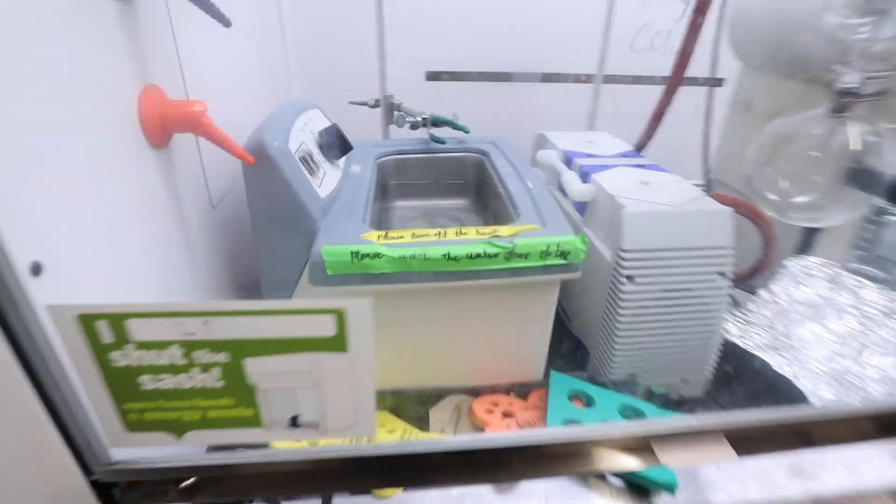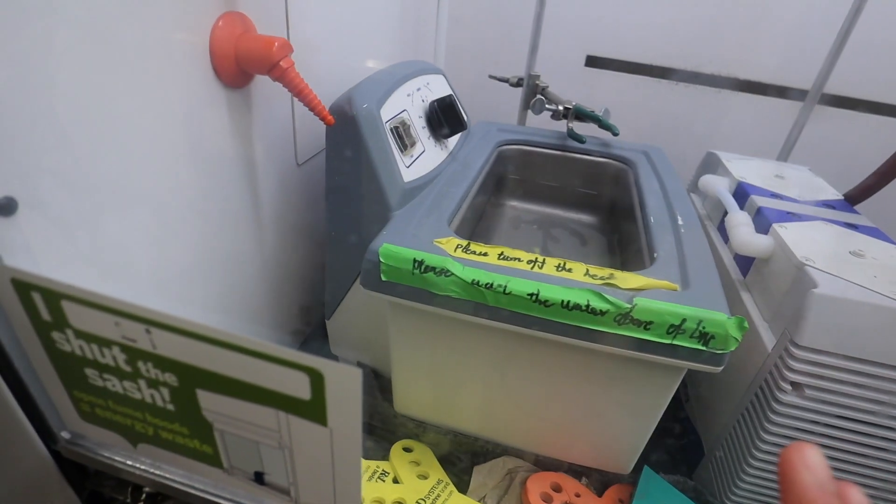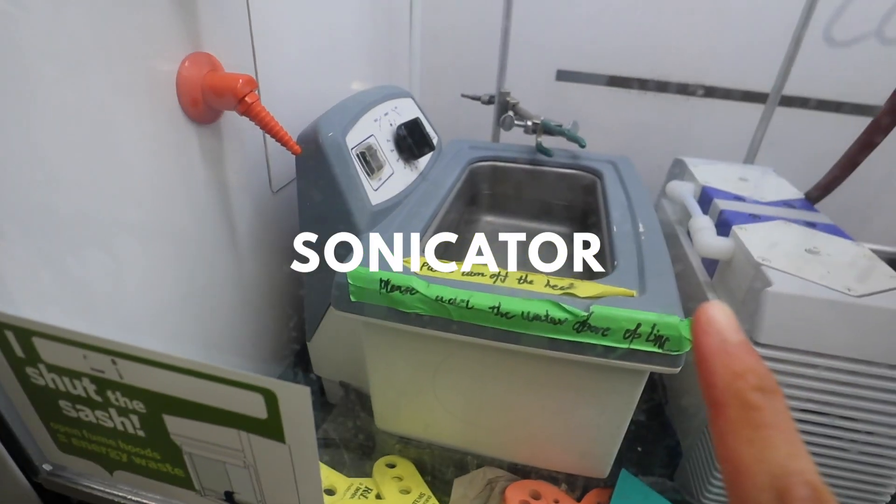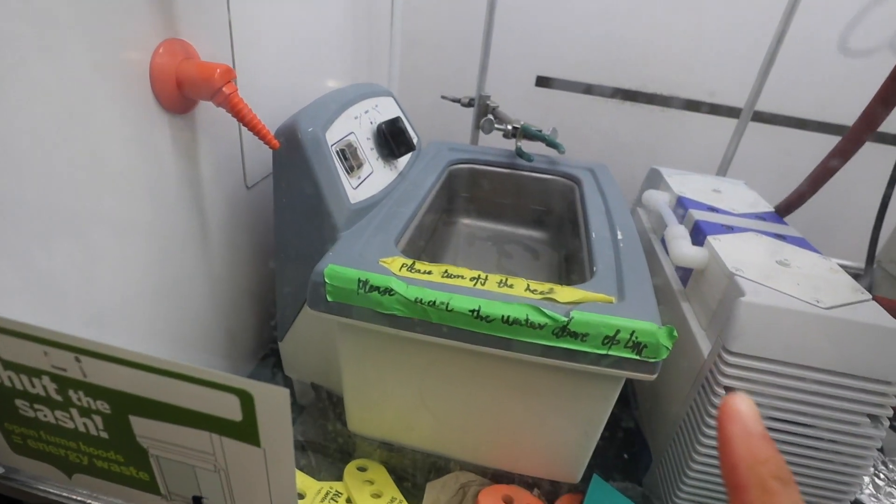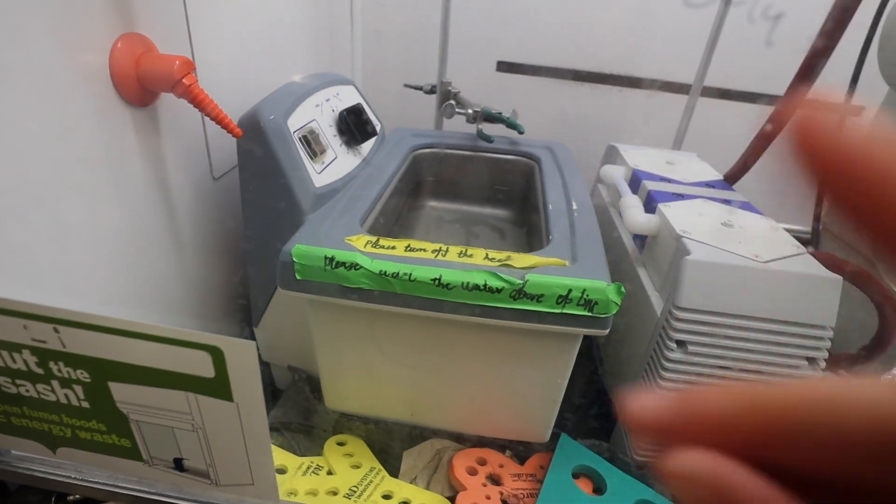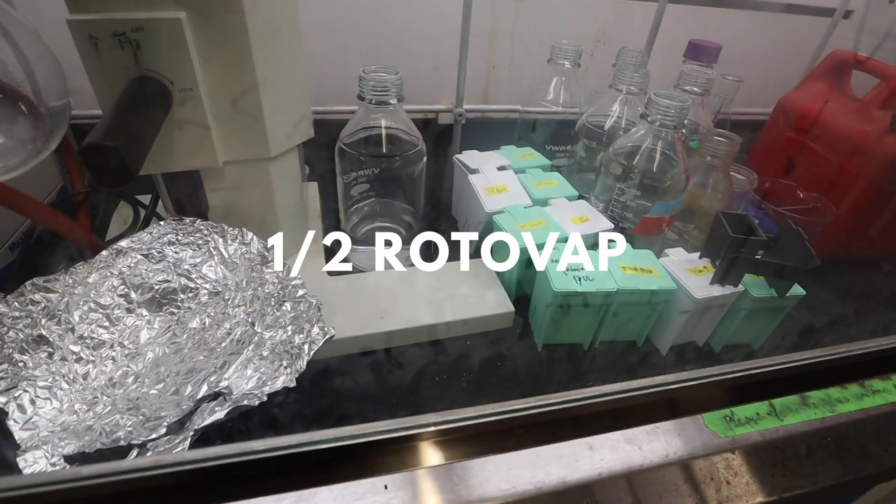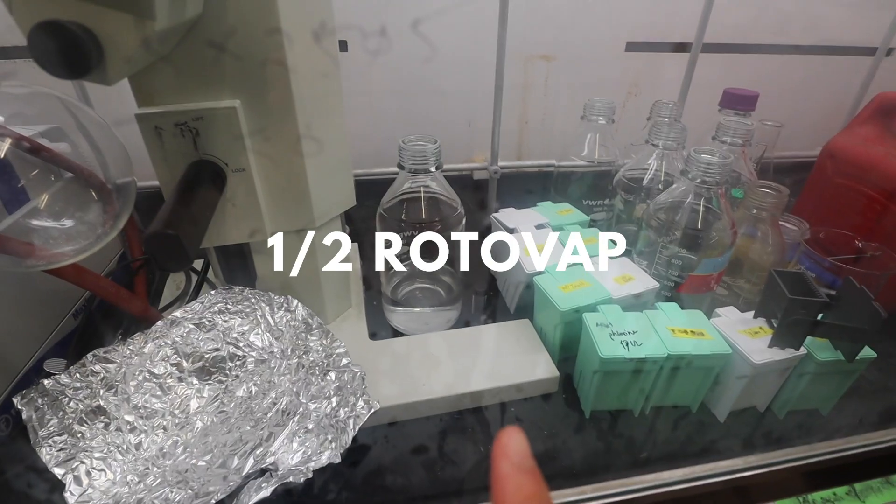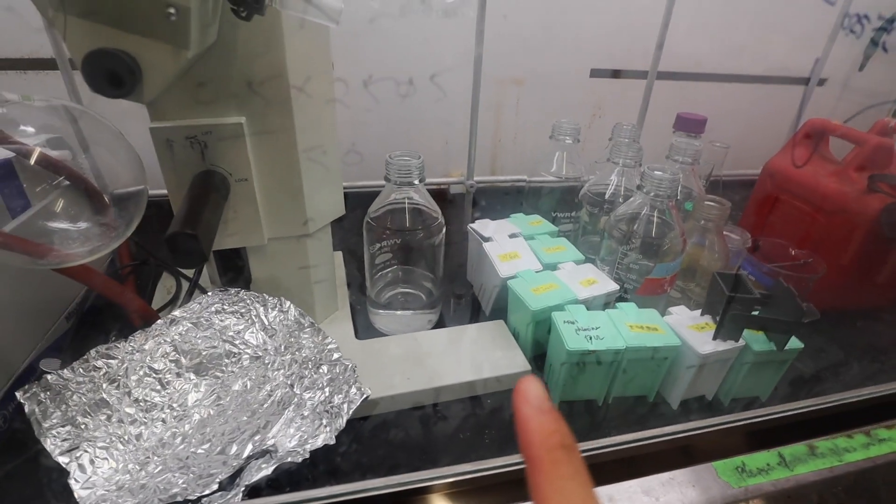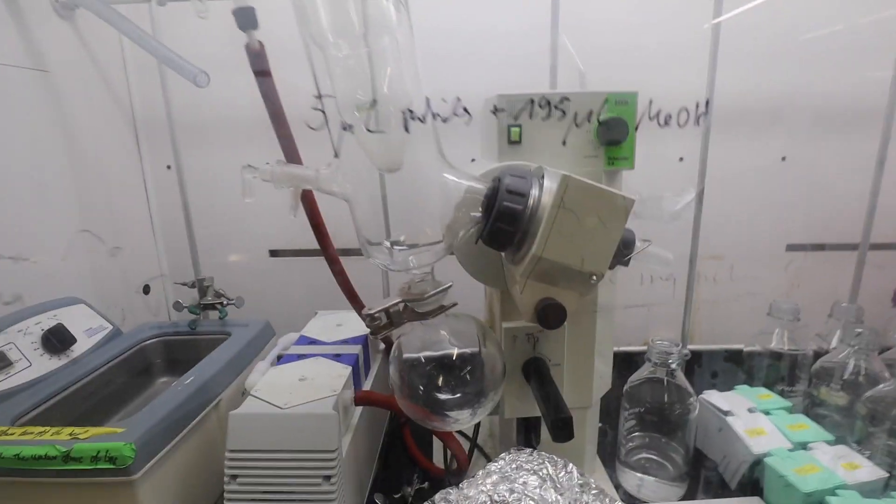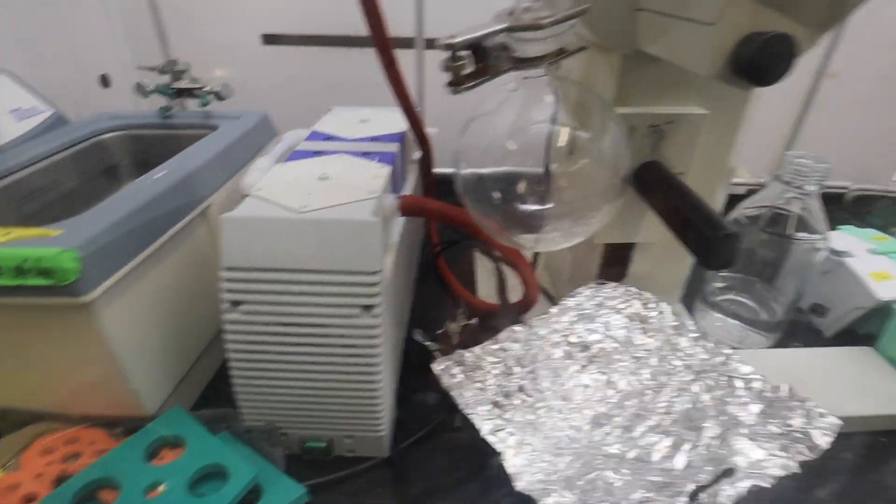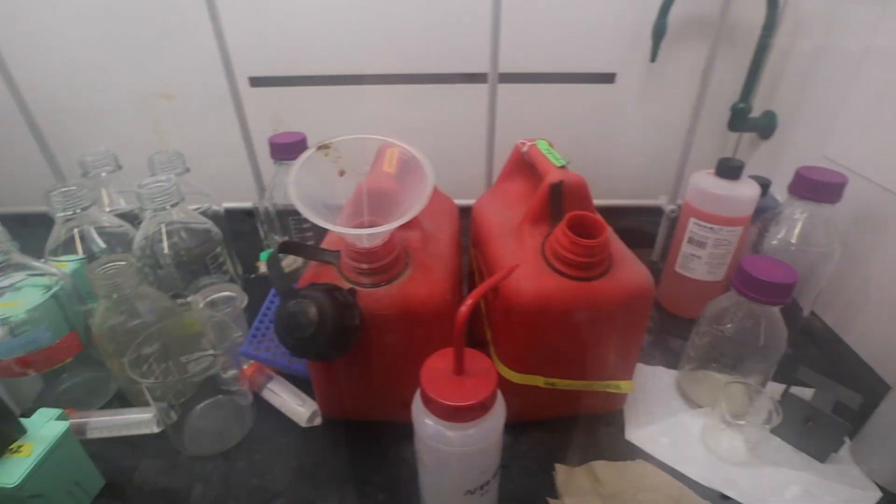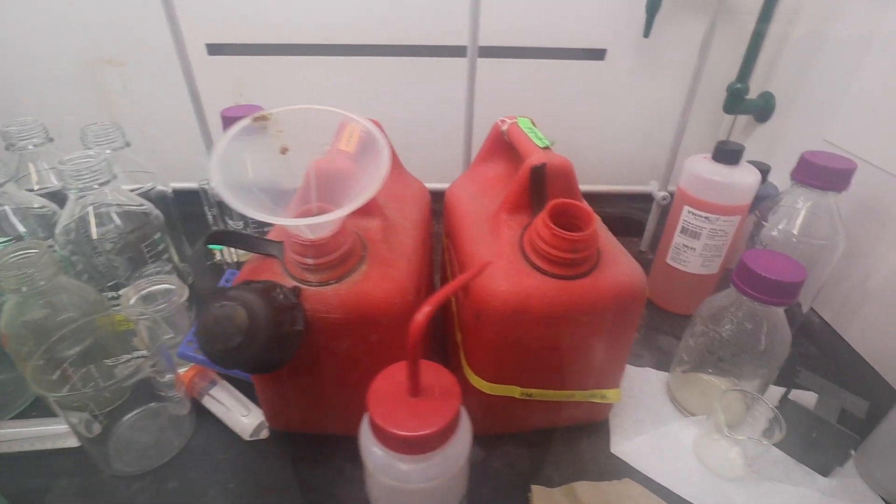This hood over here contains the sonicator. So this uses waves to really vibrate and mix things together really well. This is part of a rotavap. It is missing the tub which is over at KK's old bench I think. But yeah we rarely use this one because we can't really control the pressure of this vacuum very well. So this is just like a backup rotavap. Our non-halogenated and halogenated waste coming over here.